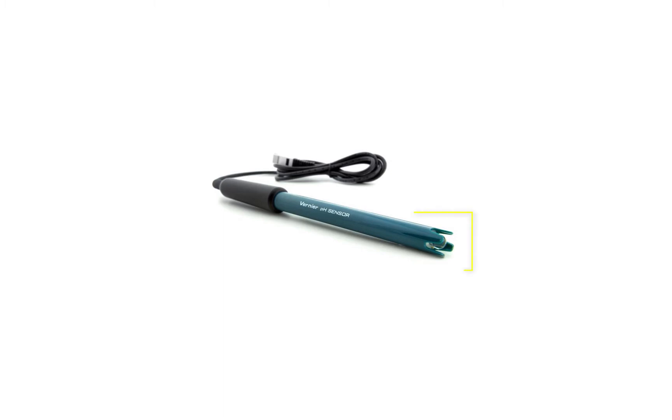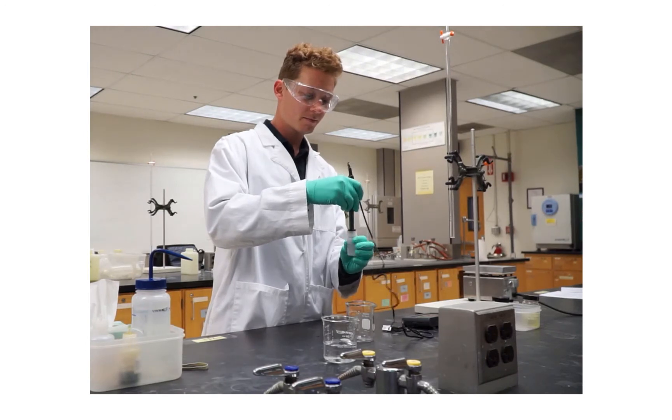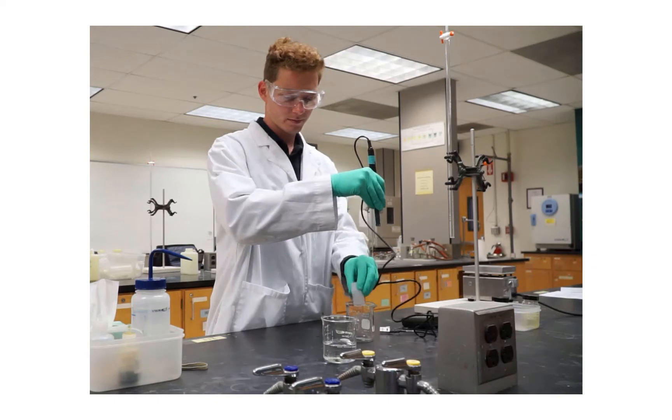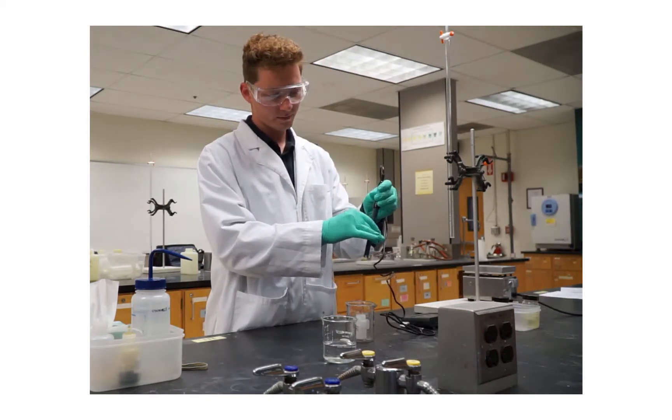a glass bulb. It must be in contact with the solution we're measuring. Be very careful that the glass bulb is not broken while working with this probe. You want to make sure that this pH sensor is always stored in the pH storage solution shown here.